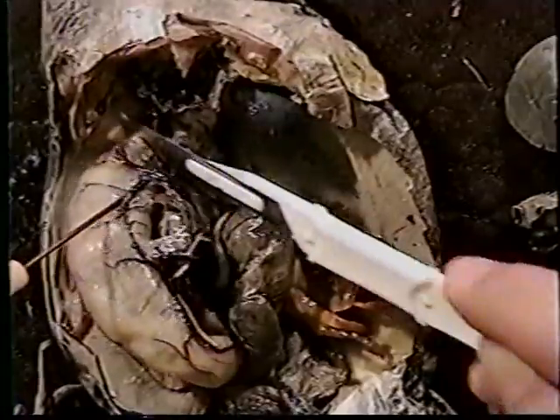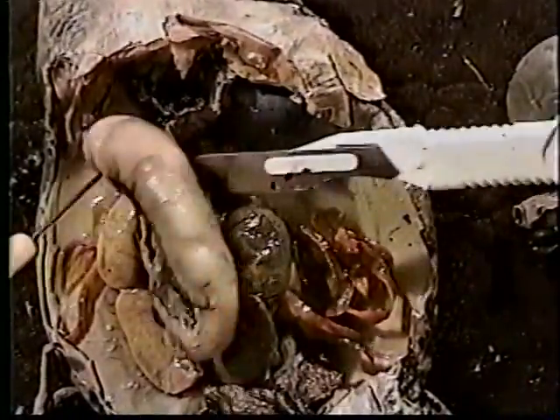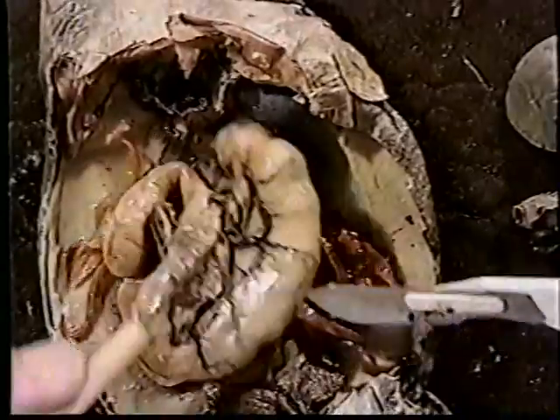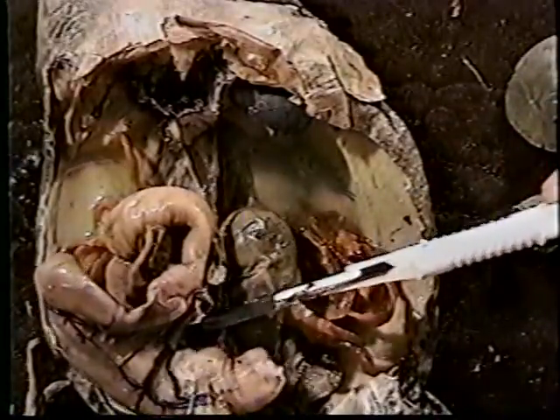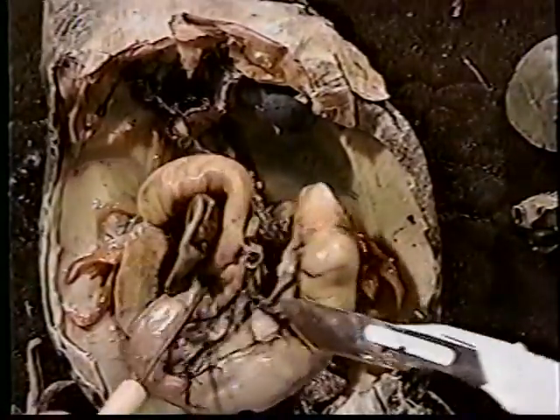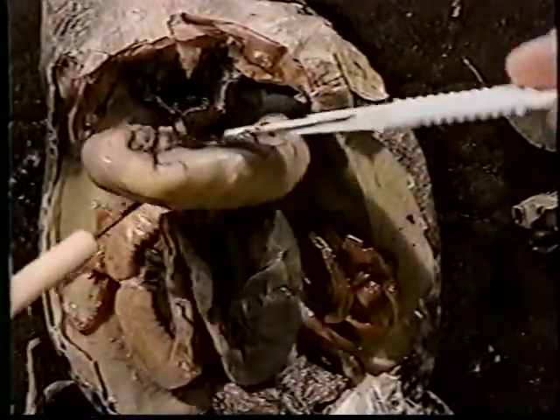This should be rather easy if you can effectively cut one end and go from there. Once again, we see the importance of the complicated system of blood vessels that intertwine themselves around every organ in our organism.